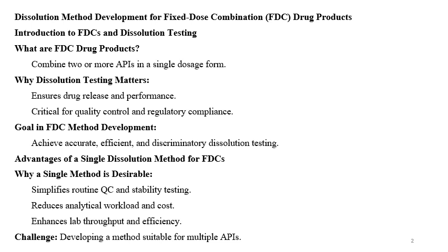Dissolution testing is required as an in vitro testing to know the in vivo behavior. Dissolution testing matters because it is required to ensure drug release and the product performance. It is critical for the quality control and the regulatory compliance. Dissolution testing is a performance testing. Also, it is required to meet the quality requirements.